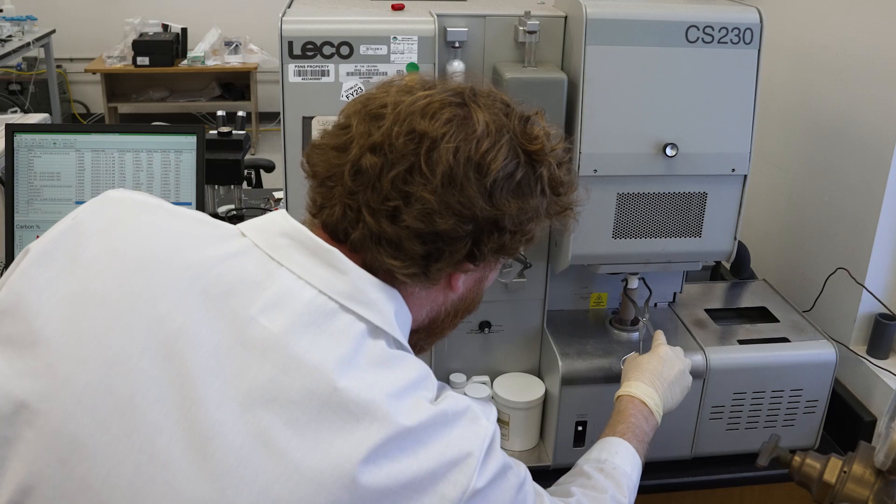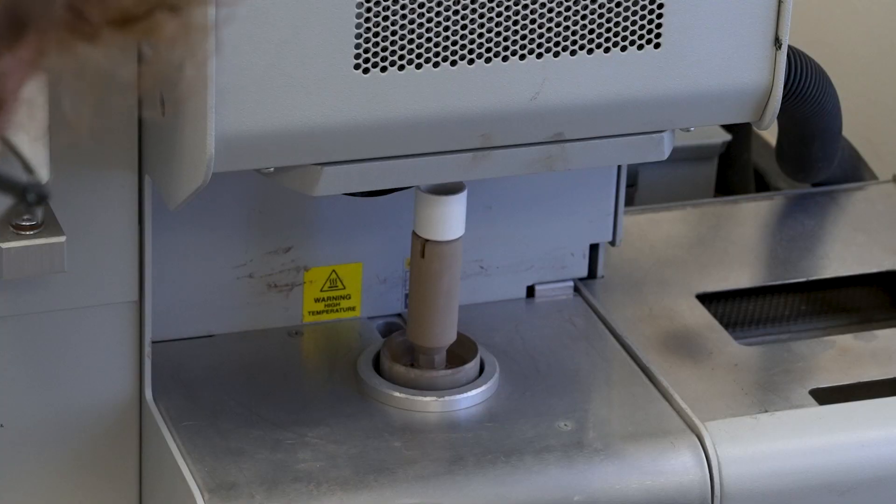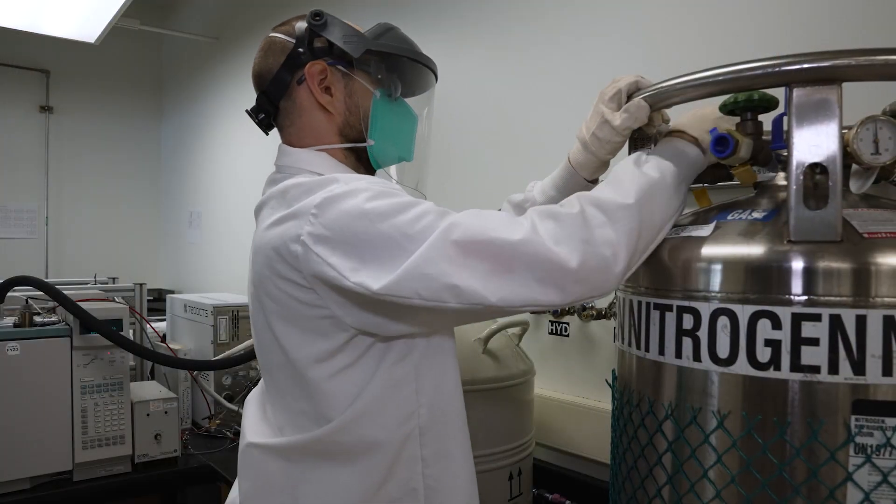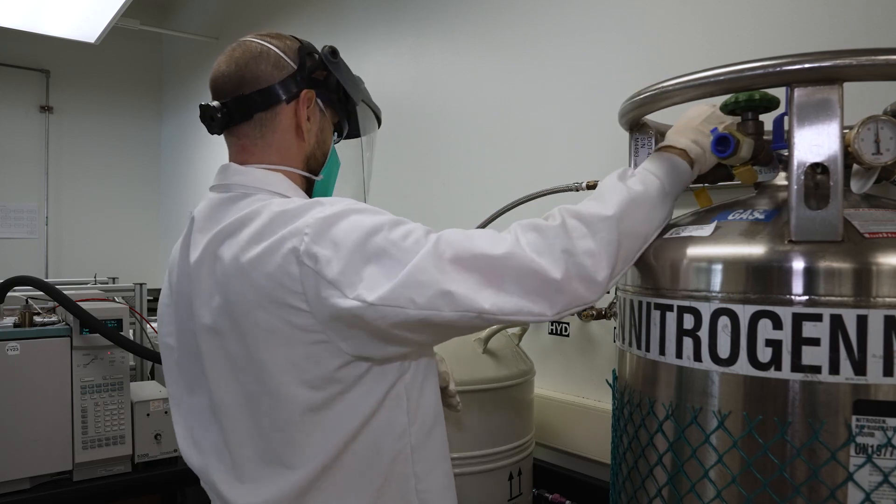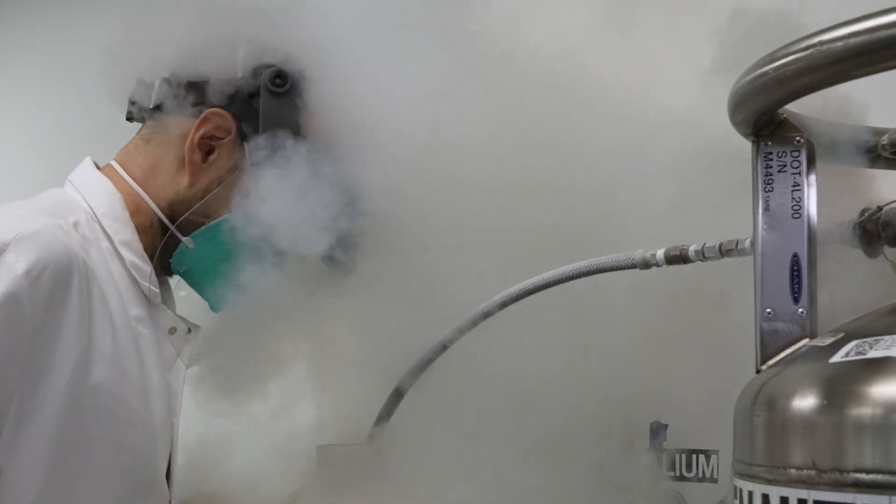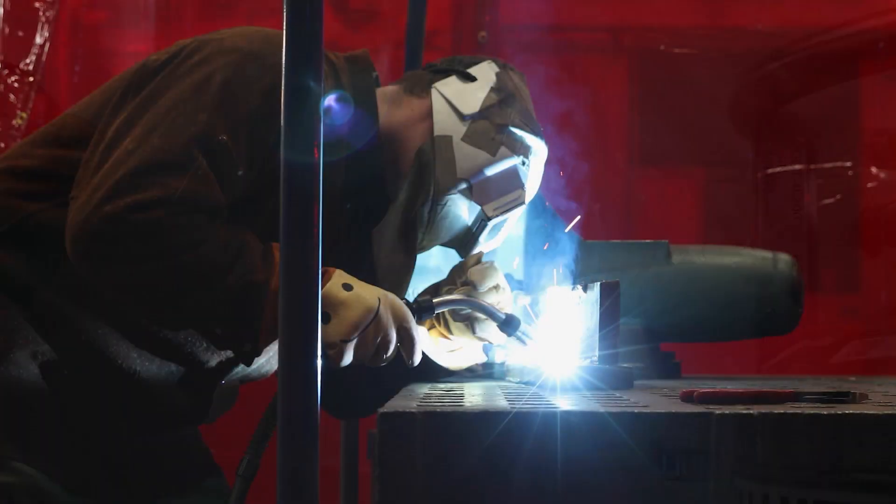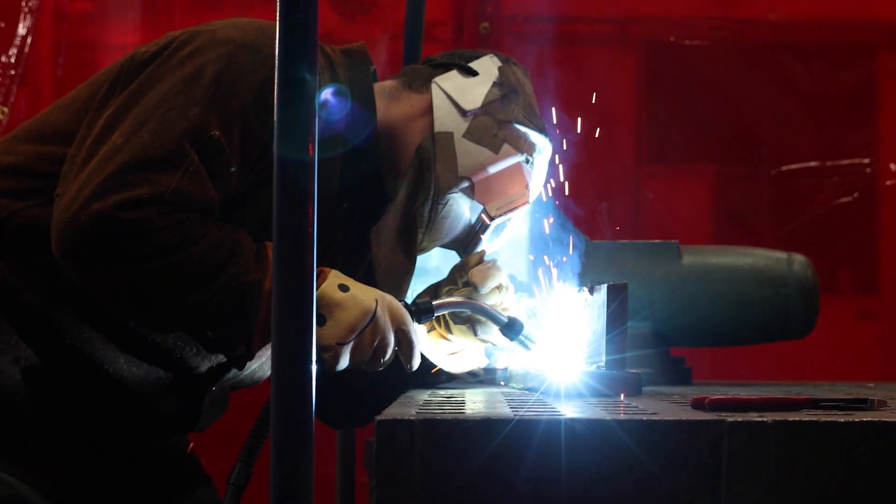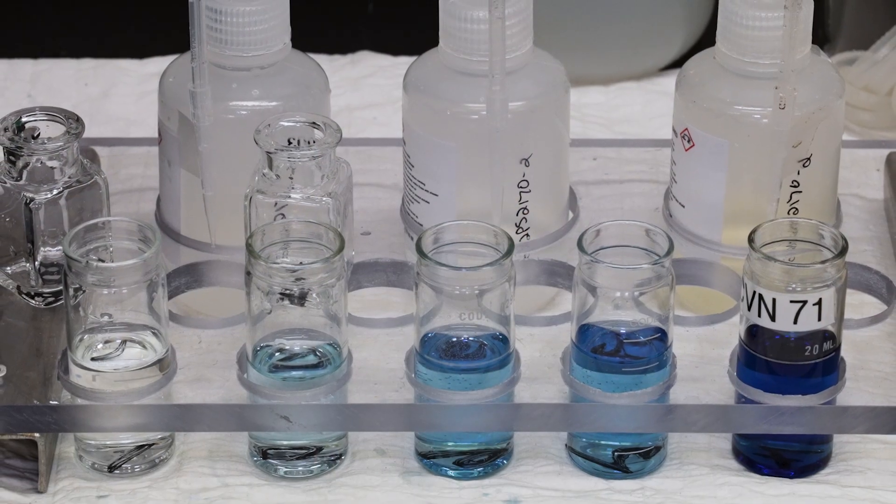We also offer quantitative analysis of chemical compositions for metal alloys and Evolved Gas Analysis that helps Code 106 identify potential compounds volatilize during welding and supports 134.5's Unknown ID Analysis.